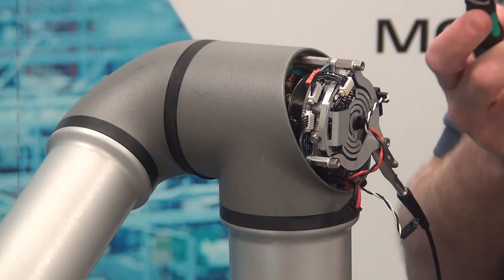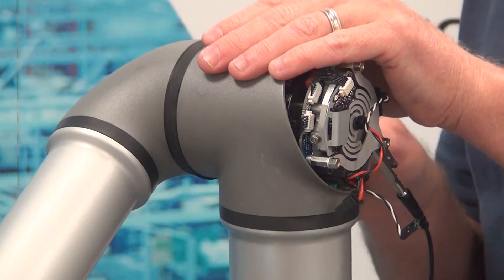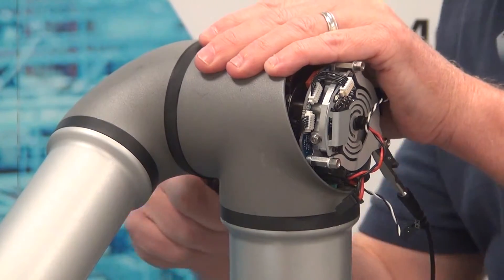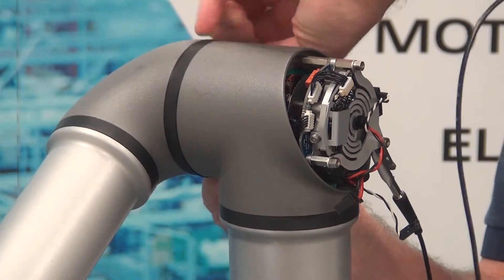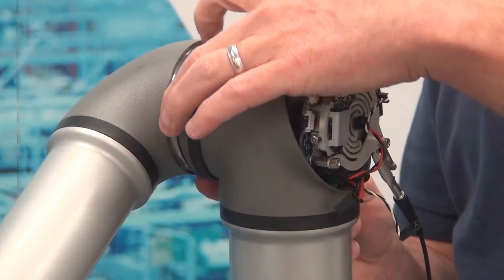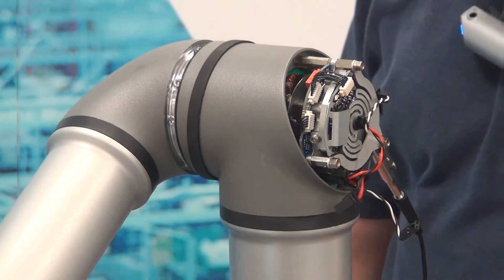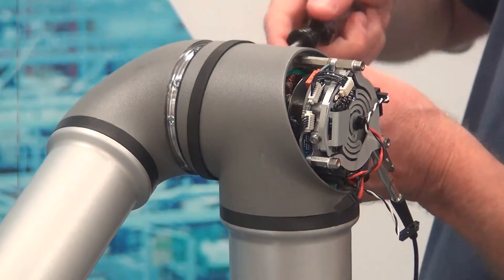Next we're going to take a small flat head screwdriver and gently pry the gasket out from around the joint, then work it out so that you can remove it out of your way. Then we're going to slide back the plastic ring. We now have access to all of the screws holding the joint in place. These are a size T10.